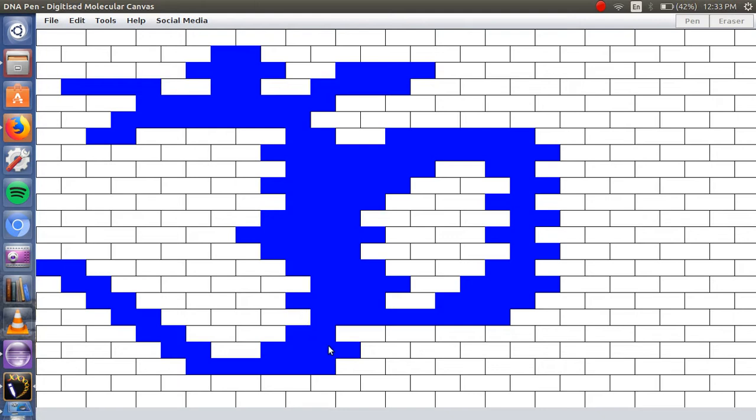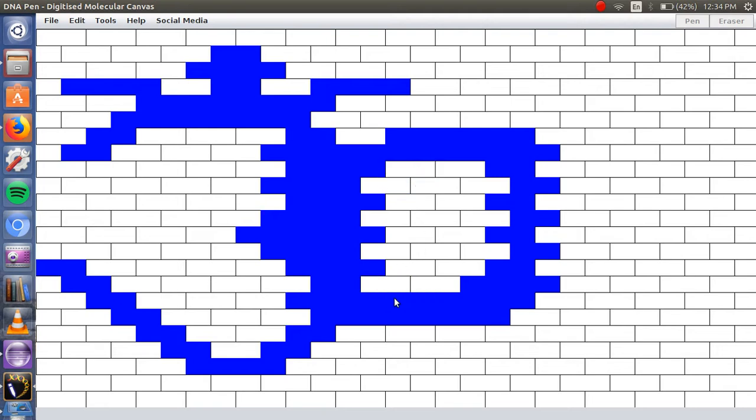You can have something like this, and maybe remove this, maybe have this, maybe remove this. Now it resembles an Om more. You'll have to do some fine adjustment, but the initial work of clicking all the bricks has been removed, so it is all automated now.